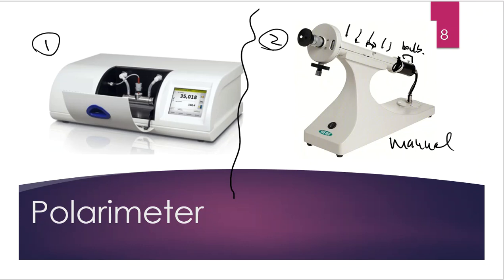And then this eyepiece is the piece that begins to rotate. I will look through that little polarimeter lens. It's like a little microscope eyepiece, and I'll see just pitch black, or maybe pitch black on the edges and some light in the middle, or maybe some light on the edges and pitch black in the middle. It really depends on the type of polarimeter that I have, and I'll talk about that in just a minute. Either way, I'm going to see a distorted image, partially dark and partially light.